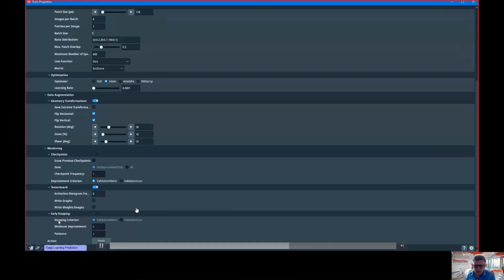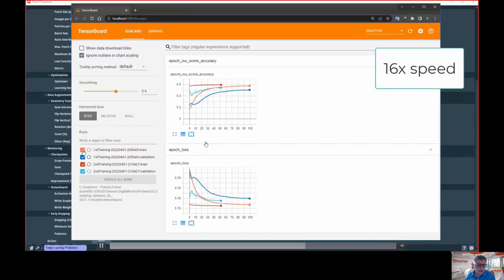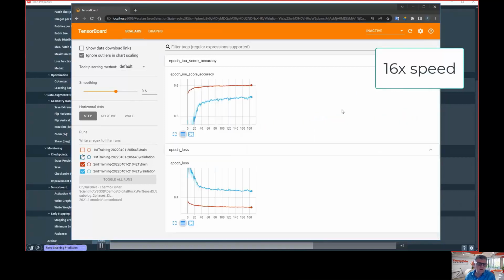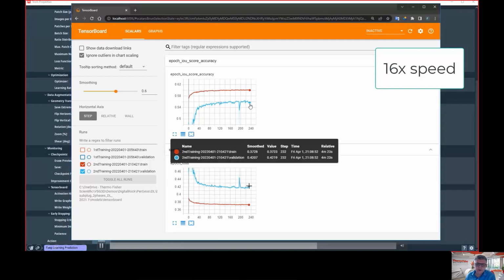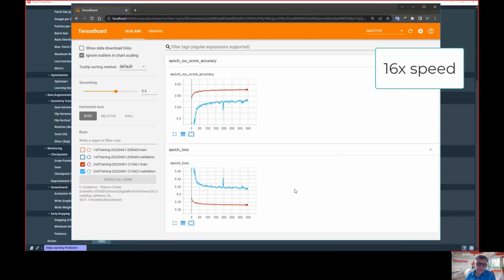Yeah, for monitoring, I can jump a little bit. I think I did play. So we start again our TensorBoard, and you will see the previous one and the new one. You can select or not, and you will see the second one is trying to converge even better than the first one. So I accelerated because it was quite some time.